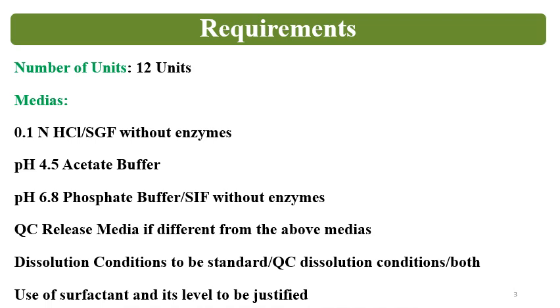What are the requirements for showing the dissolution similarity? Before going to the statistical calculation, before going to the model dependent or independent similarity demonstration, some key requirements are there, and without fulfilling them, the dissolution similarity cannot be demonstrated. Always remember that the data going for the dissolution similarity demonstration should be of 12 units. Many times 6 unit data is also considered, but that is for the research phase, and 12 unit data is required for regulatory filing.